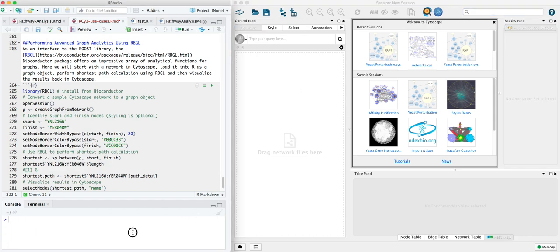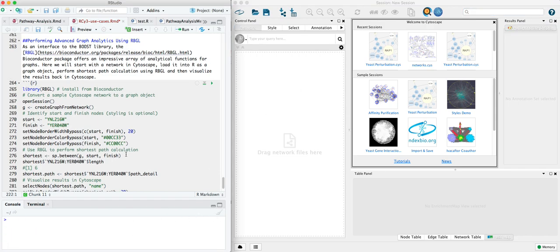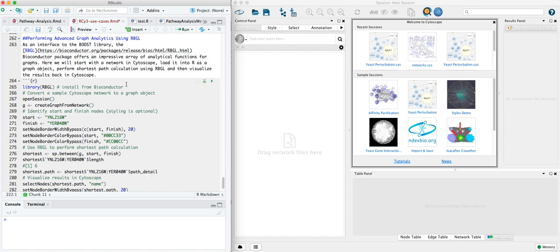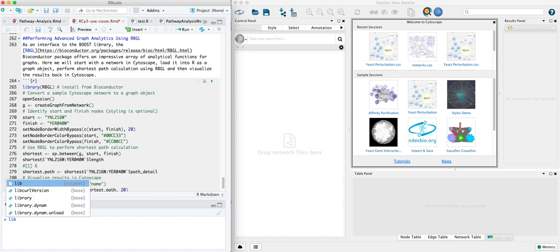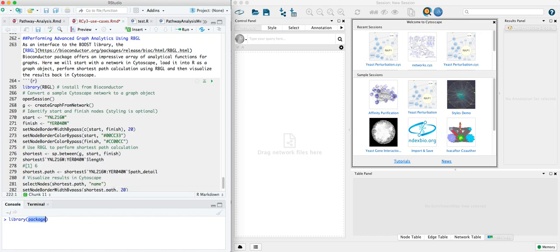The first step before walking through this use case code is to make sure we have RCy3 installed, and then the next step is to install the RBGL package from Bioconductor. You can follow the instructions at Bioconductor for how to do that.